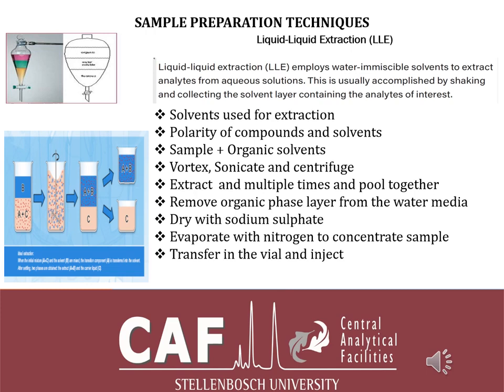And then also it is important to add a little bit of sodium sulfate to dry your organic solvent, because the water that might be retained is not good for your GC, or it might also affect the sensitivity of your compounds.